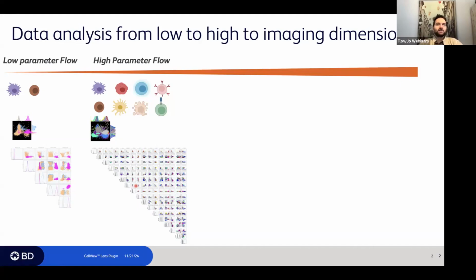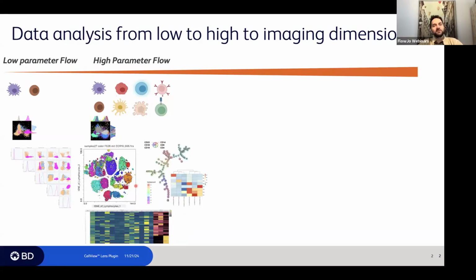In such a case, you might have already heard of the high dimensional workflow we use. Specifically in FlowJo, we can do this with different algorithms or plugins. Those could be dimensionality reduction algorithms, clustering algorithms, as well as visualization tools. This makes it much simpler to extract all the information and to visualize our samples simultaneously in one plot.